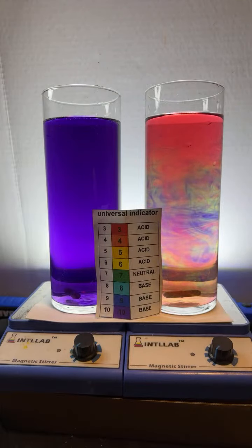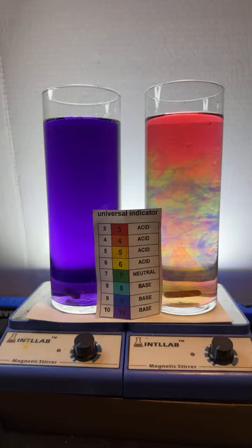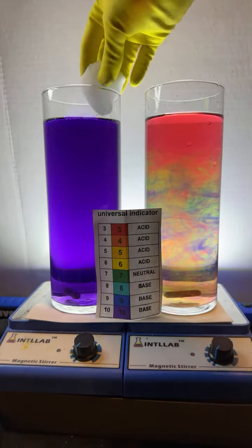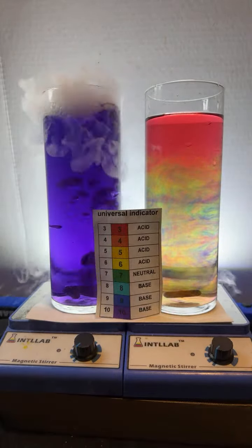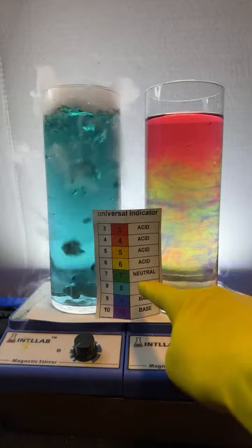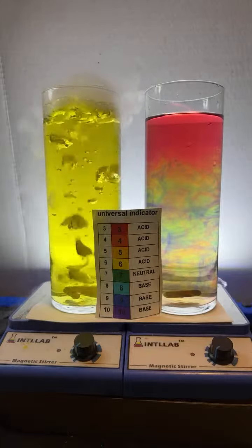Okay, now what I'm going to do is add some carbon dioxide to this. I told you carbon dioxide is an acid. All right? So if I add carbon dioxide to that flask over there on the left, the pH should drop. How am I going to add carbon dioxide? I'm going to add carbon dioxide by adding dry ice. Dry ice is solid carbon dioxide. So in it goes. And if carbon dioxide is indeed an acid, we should see that pH drop as the CO2 bubbles through the solution. Oh, it's pH 9, it's pH 8, it's pH 7, it's pH 6. That's what carbon dioxide does when it goes into water.